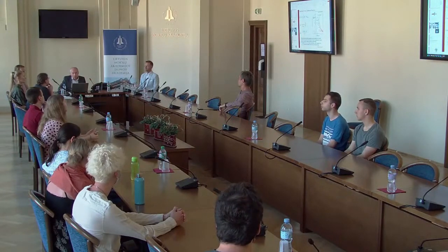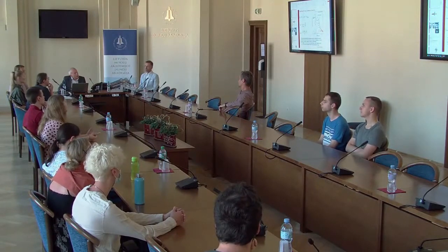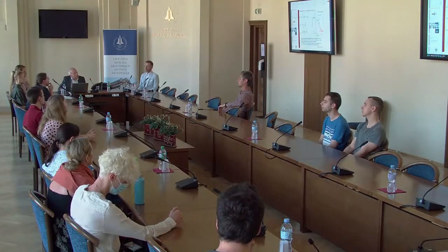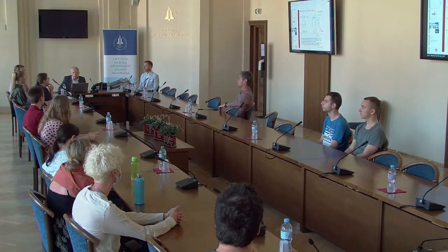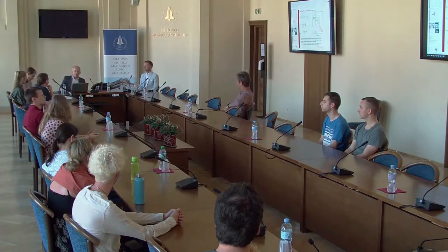šitomis linijomis, kurios yra labai siauros. Ta prasme, mes galim spektro panaudoti ne tą continuous radiation, bet mes panaudojam characteristic radiation. Ir čia yra monochromatinė banga, sakysim, 9 kiloelektronvoltų nuo vario metalo. Ir tą galima naudoti micro-CT.